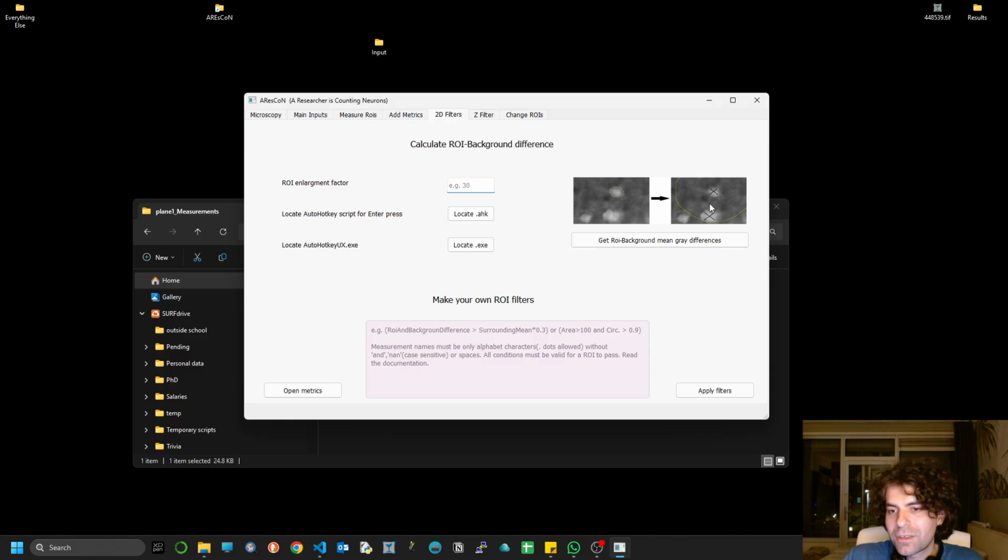So what the macro is going to do here is that, imagine that this is the region that you're going to take as a relative background. Anything that has been detected by CellPos as a candidate region of interest, just like this, will be taken out.